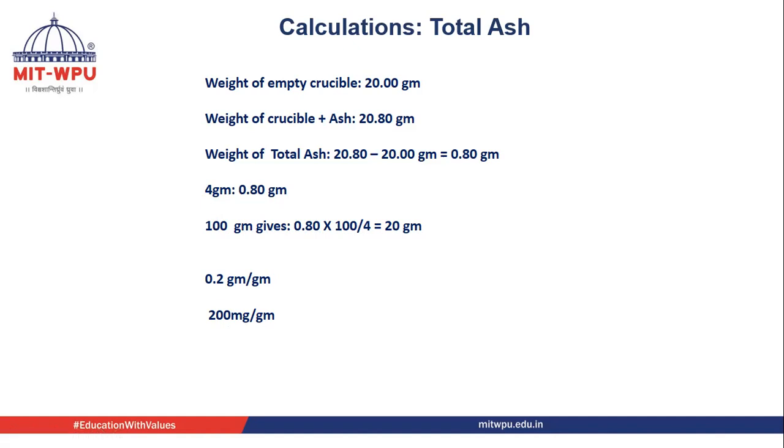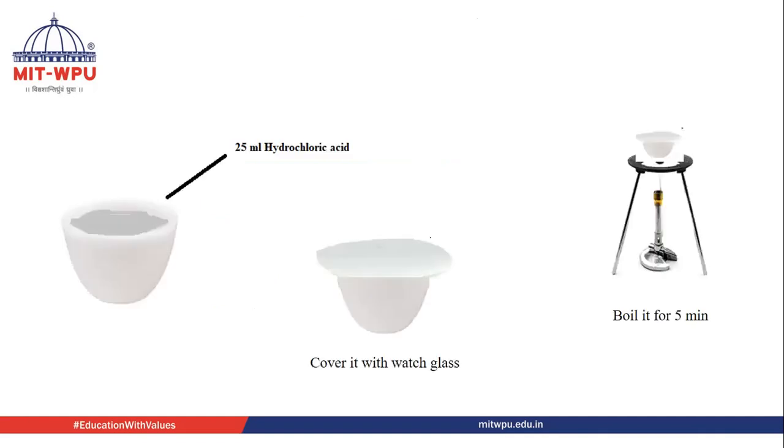But there are n number of compounds or drugs available in nature, so many of them will be having the same total ash value. So we can go to another ash value, that is acid insoluble ash value. And this ash value is generally carried out to determine the silica.